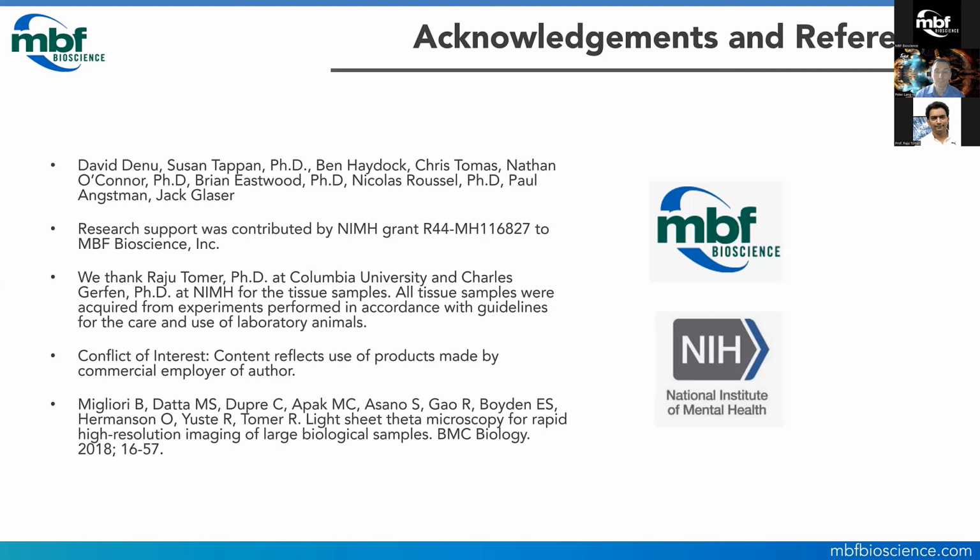But as I understand, that's not yet implemented in ClearScope, right? The live imaging capability. That is correct. That is not implemented as of yet, but it is on our development roadmap. Okay.